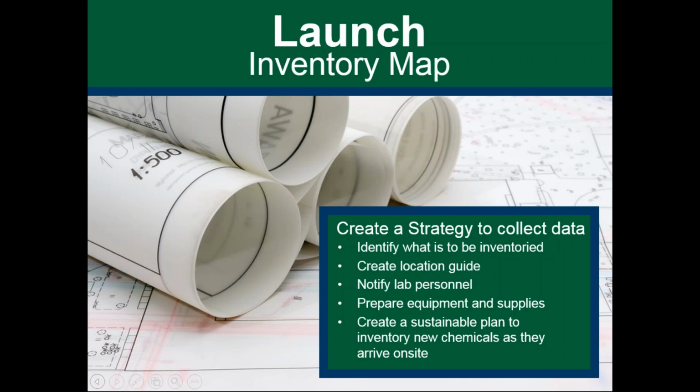And then you also want to prepare equipment and supplies beforehand. So assessing things like laptops, scanners, barcode printers, some of these physical things are going to help you actually inventory this material, and how you want it set up. If researchers are going to be doing a lot of the inventorying, does it make sense to have a computer set up in each lab with a scanner so that that's where all that data transfer can happen?